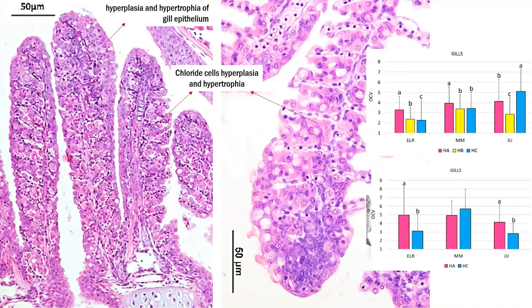I remind you again that in OCV all the pathological lesions are considered.